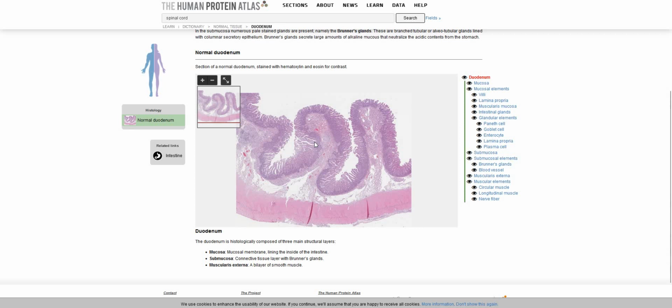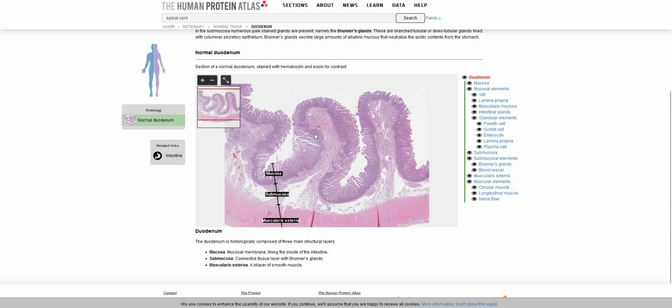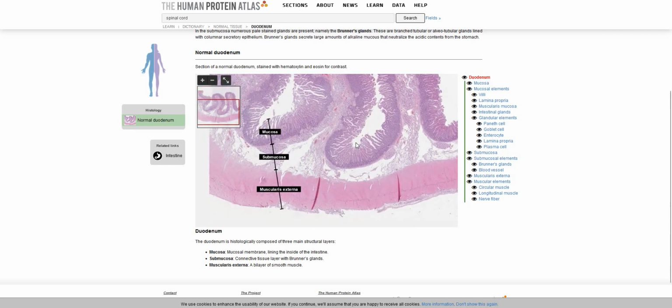The way our microscopes work in class is we have one slide with 3 separate dots, and each of those dots is a different part of our small intestine. What you will need to know for the exam is how to identify the 3 distinct regions from that slide. That is something that we will practice in class on December 1st.